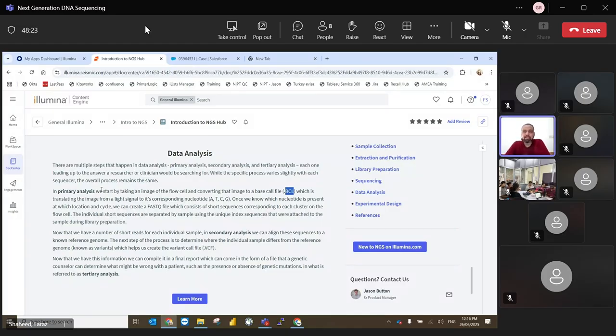So these base call files, we still don't know which sample they are coming from. These are all the reads from the 96 samples that we took initially, and now we have reads from each of the fragments. Now each of these fragments, when they are demultiplexed, or when the system reads on the basis of the indexes, and then with a bioinformatics pipeline, it separates the samples. This is known as FASTQ generation.